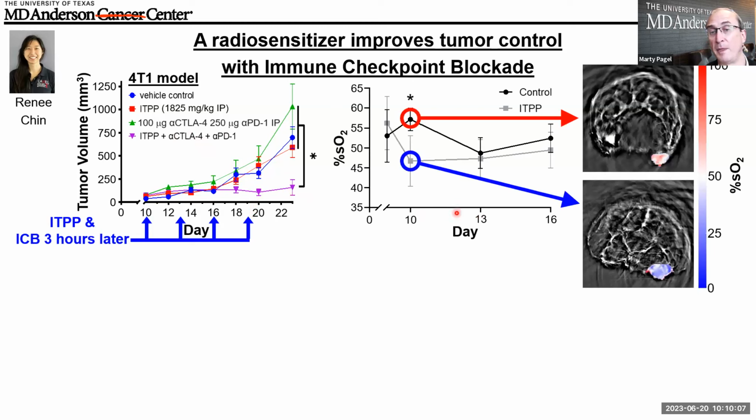And so does that work with this method? Well, yes and no. And that's why I wanted to highlight this method relative to EPR. I think it's a very interesting use of MSOT. But in this case, we're watching how the radiosensitizer agent actually releases oxygen from hemoglobin. So you get a counterintuitive decrease in percent SO2 as you oxygenate the tumor.